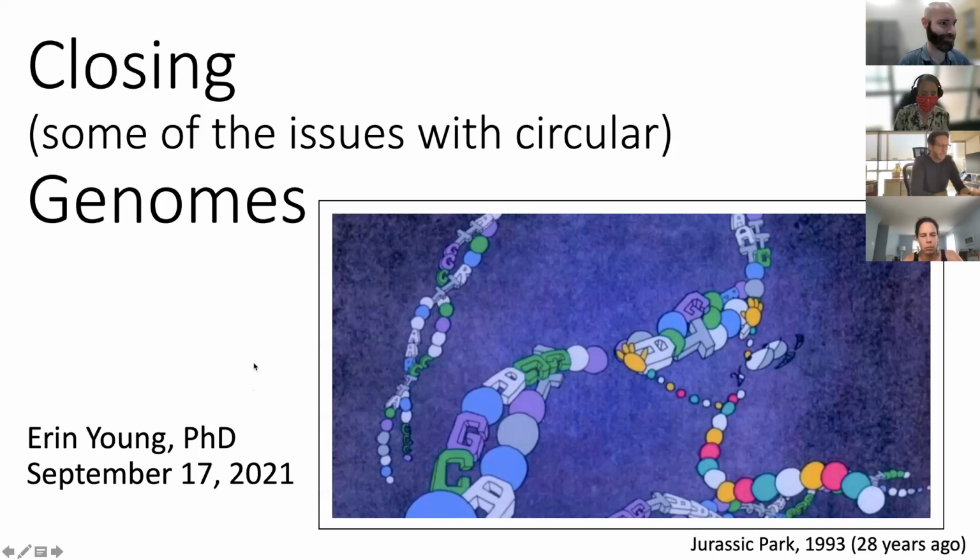So today I'm going to be talking about closing genomes with a special emphasis on nanopore sequencing, although a lot of what I talk about today can also be applied to PacBio.